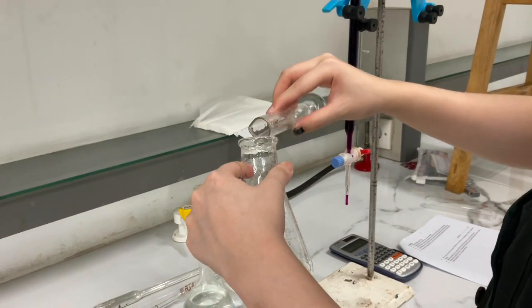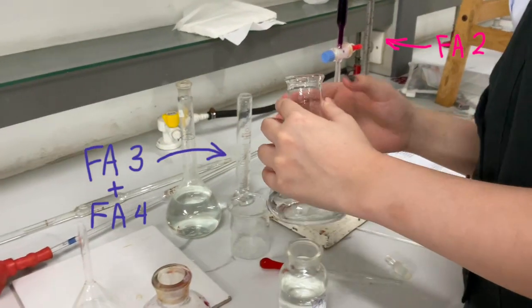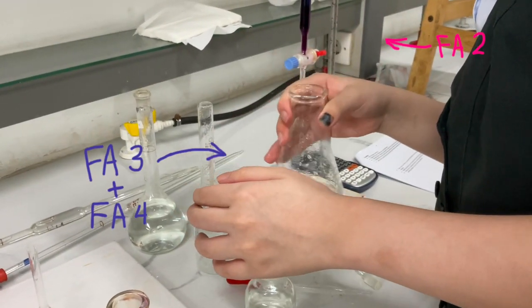So now, we've got the FA2 filled in the burette and a solution of FA3 and FA4 in the conical flask.